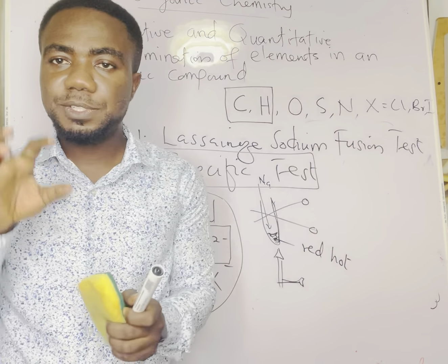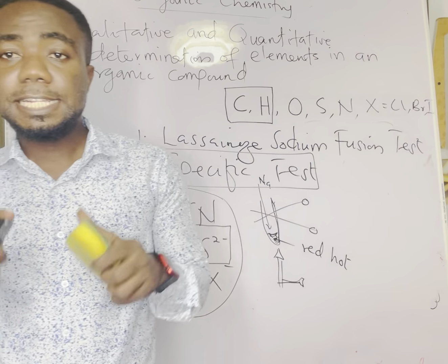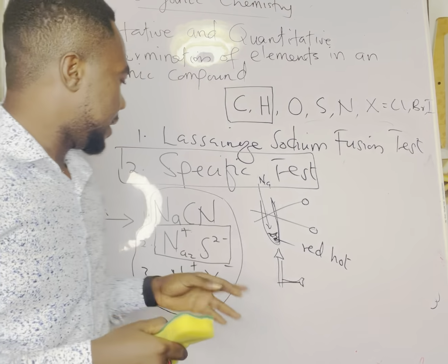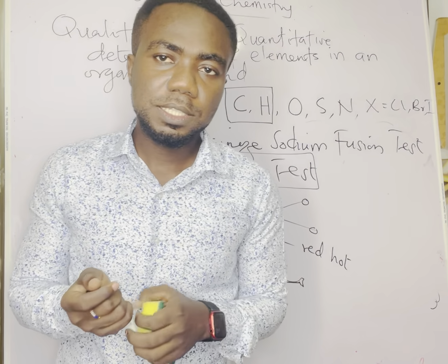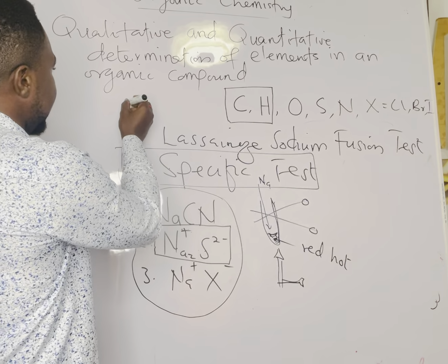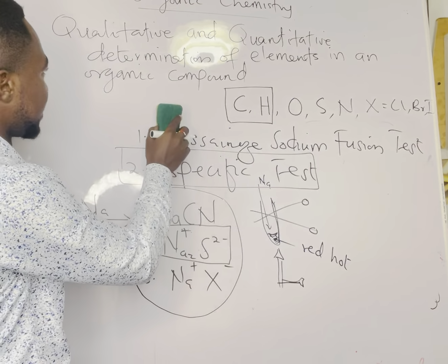This takes place in an acidic medium. The sodium there is a spectator ion. So in an acidic medium, you add what we call nitric acid.